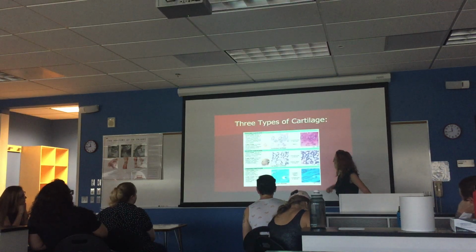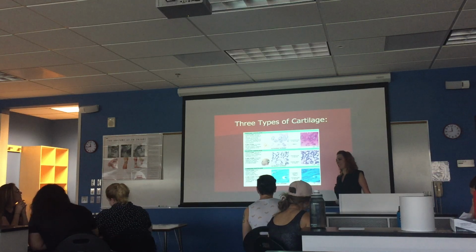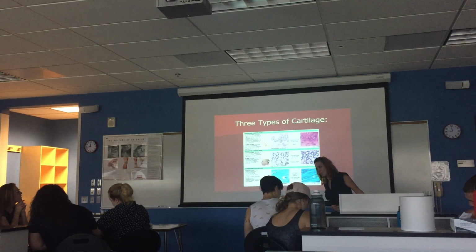All right, cartilage, another firm type of connective tissue. And it's not so simple that we're just going to look for cartilage, but we have 3 different types of cartilage.